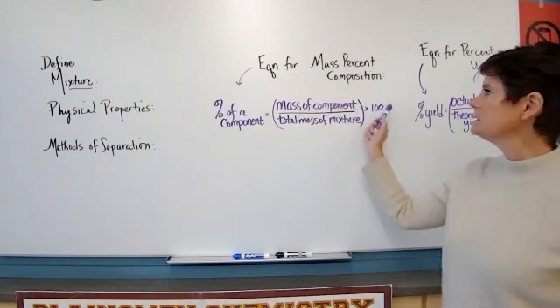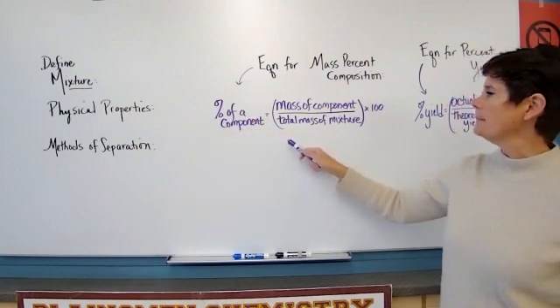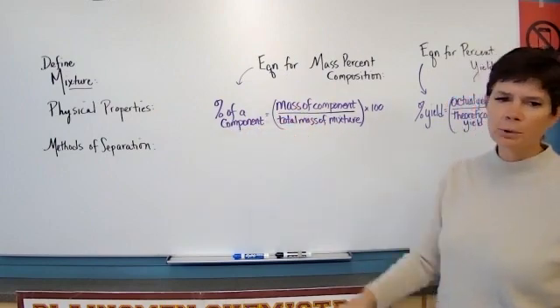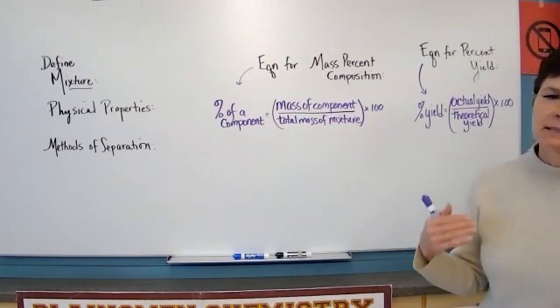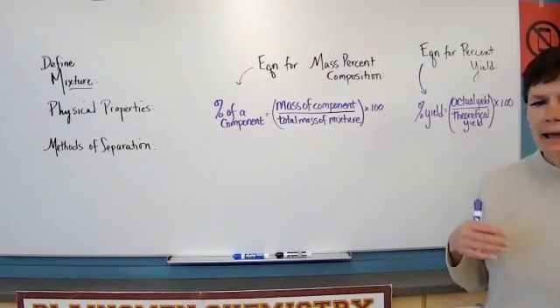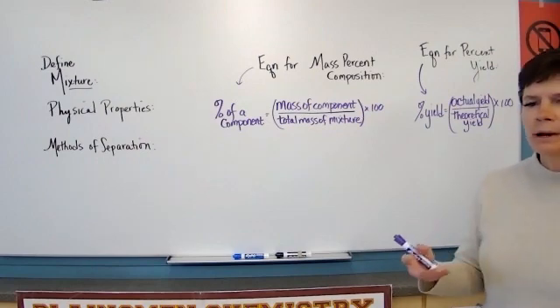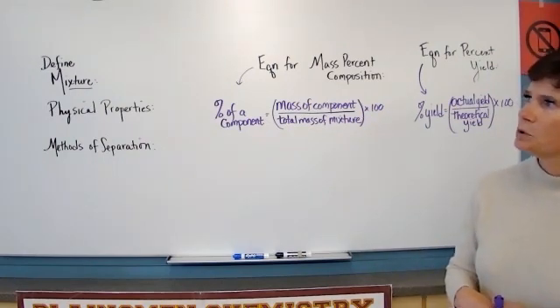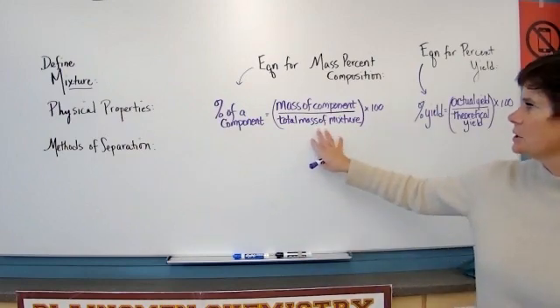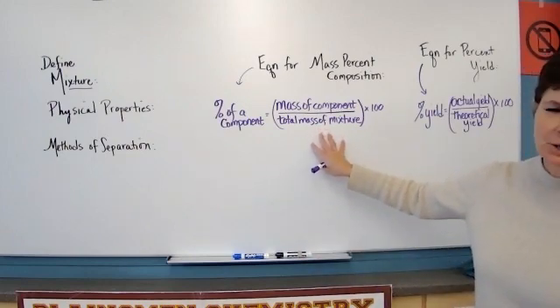We're going to use this equation for our practice problem in the pre-lab, which is separating a sample of oil and vinegar that have been pre-weighed and mixed together. Then we're going to work with a mass composition for the original mixture and talk about percent yield for that.